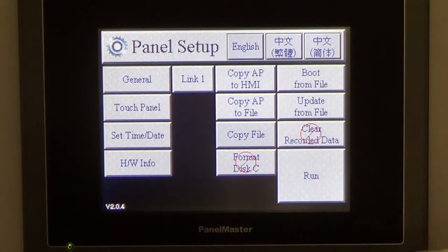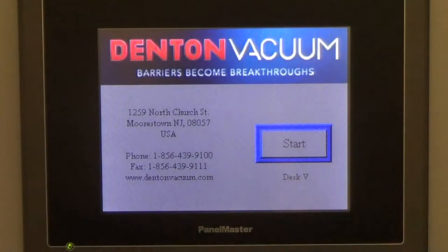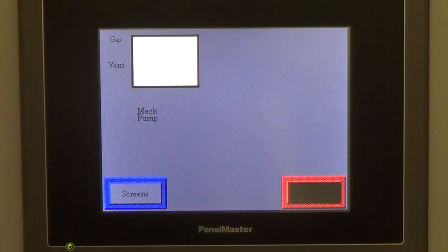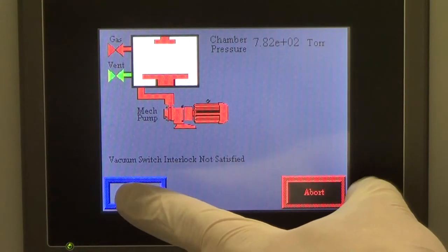Once the unit is on, press the run button on the lower right, followed by pressing the start button on the next screen. Now you are at the main screen, which gives you a system overview.